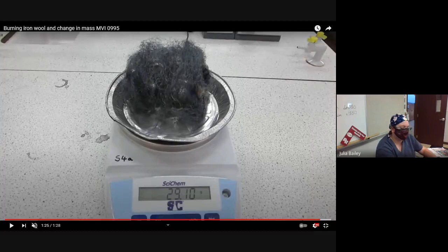So that means that if you're thinking about how math works, the ball of iron gained 1.75 grams. It got 1.75 grams heavier from burning it.